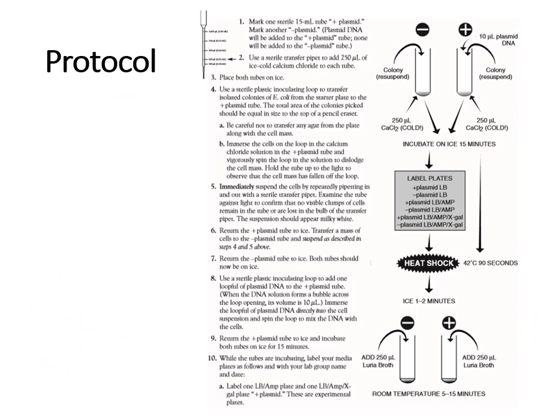So now in your slides and in this presentation, I gave you a copy of the exact protocol that we usually use in the classroom in our genetics lab, so that you can take a look and kind of get used to seeing how the steps might actually look in terms of what you would do. Like I mentioned earlier, it always has the same key steps.